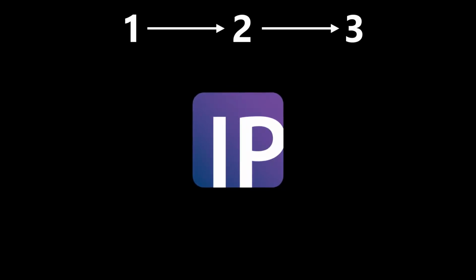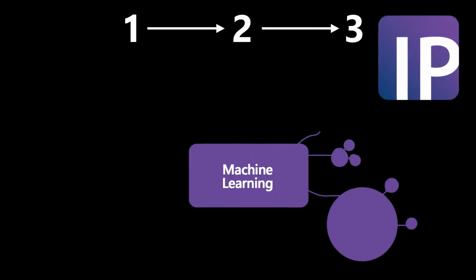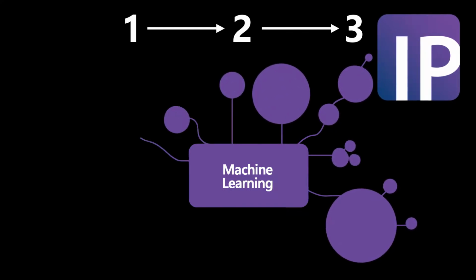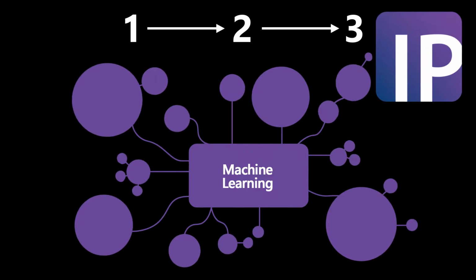Automated measurements are at the heart of Image Pro. Designed as a simple and reproducible process, anyone can achieve results easily and consistently by following our simple three-stage workflow. Built on machine learning technologies, these three stages provide a simple solution for complex samples that is flexible enough to adapt to your evolving analysis requirements.